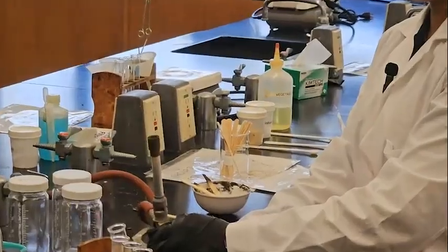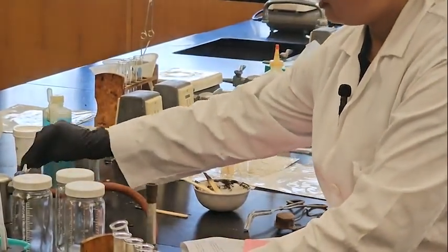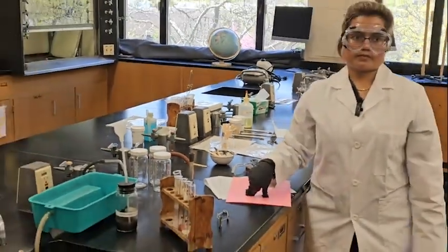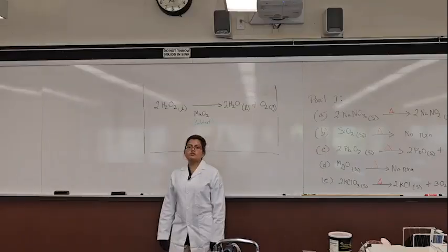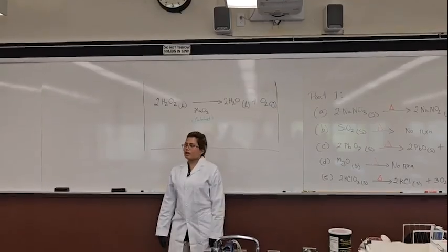To counterclockwise. It's already closed. Then you close the valve too. Now we come to the second part, which is collecting the oxygen.